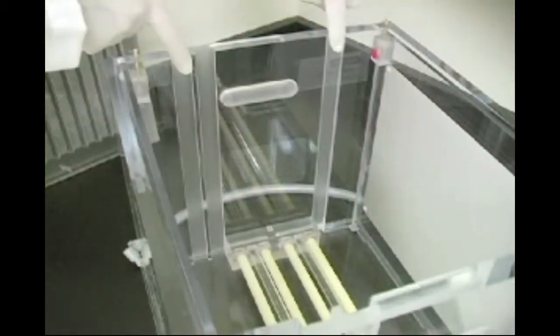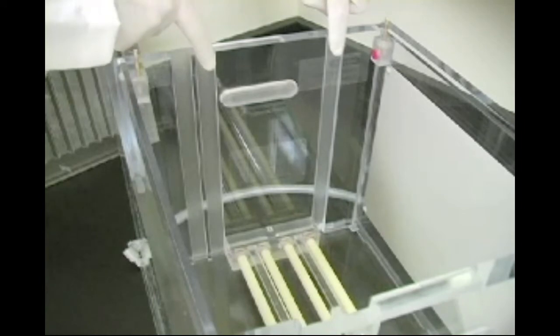There are two configurations for the gasket assemblies. The outer grooves are used for longer plates, such as the Protean Plus precast or handcast gels, while the inner grooves are used for shorter plates, such as the Protean 2 precast or handcast gels.